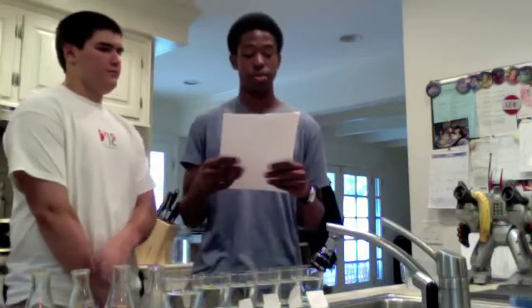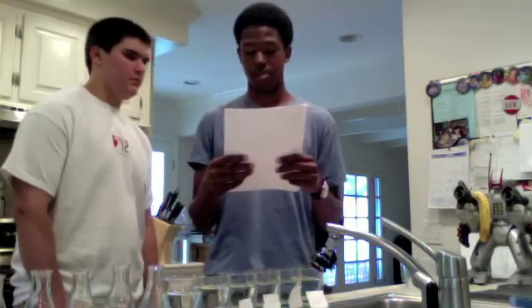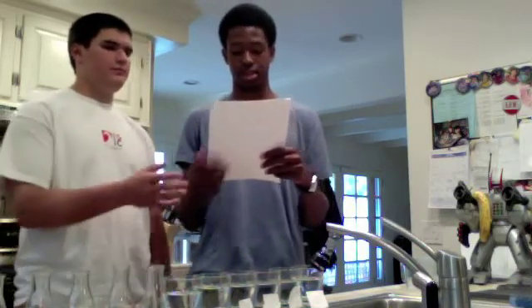In the 0.2 molar sucrose bag, 16.37 was the initial mass, 17.60 was the second mass, a difference of 1.23 grams, and a 7.0% change. In the bag with the 0.4 molar sucrose, we had an initial mass of 16.72, a second mass of 18.14, a difference of 1.42 grams, and a percent change of 7.8%.